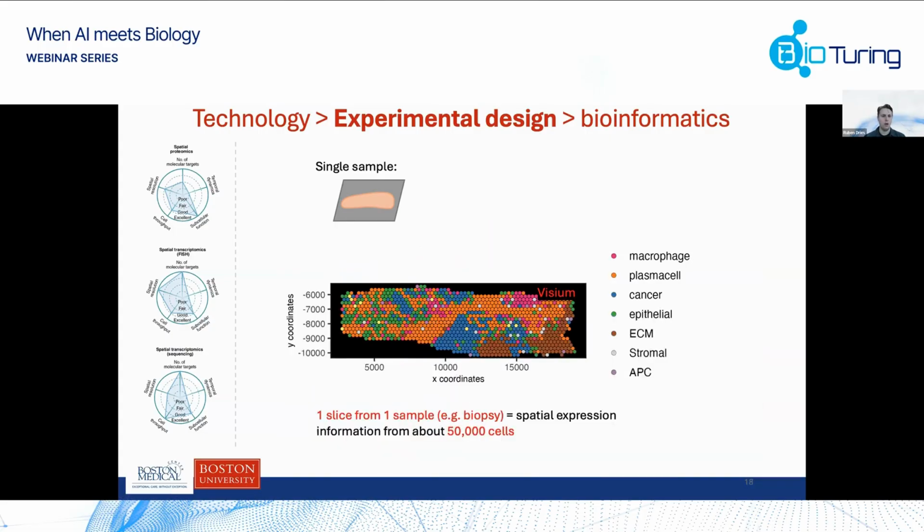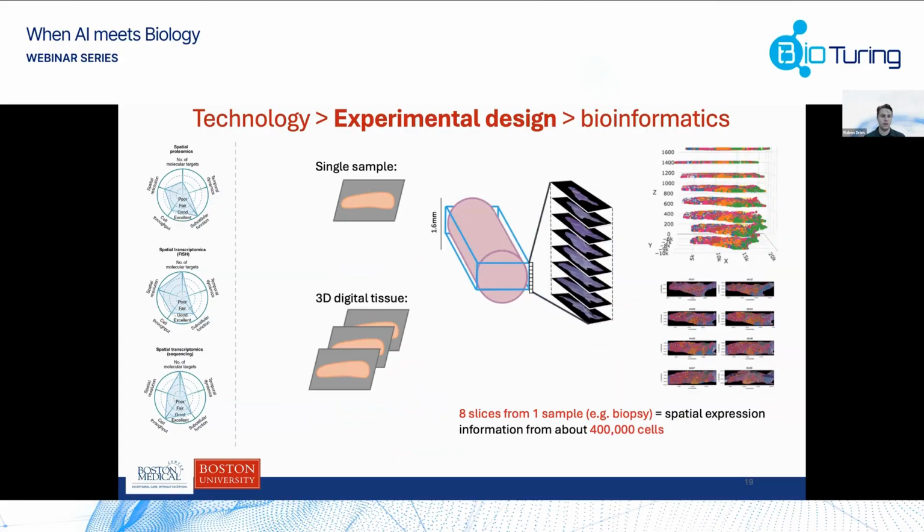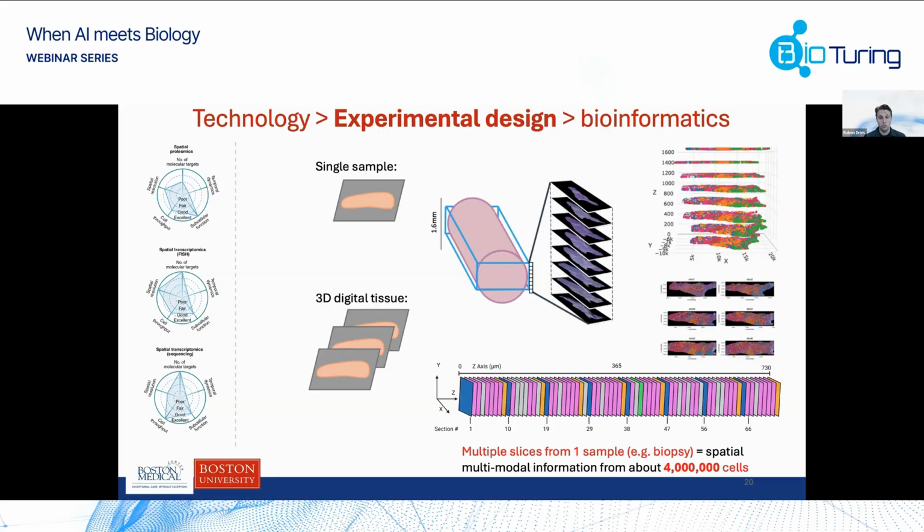But there's a lot more complex things that we and others can do as well. You can think about a single slice, but it's very easy nowadays to serially section, for example, core needle biopsies or any type of tissue and generate a 3D data set. So how do you represent that 3D data set? A single cell sample is one, but a 3D digital tissue through serial section is a whole other ball game. And you can do a lot more.